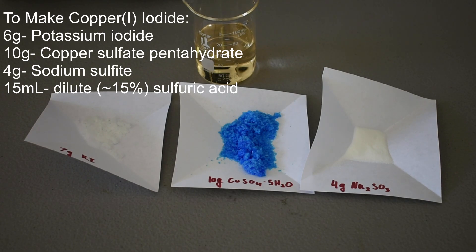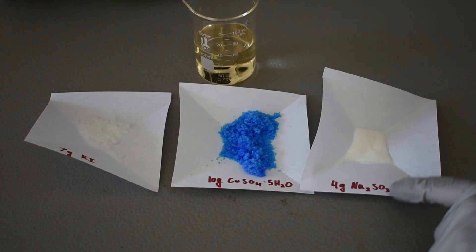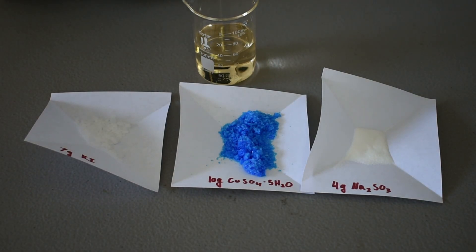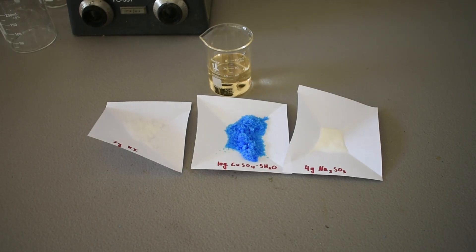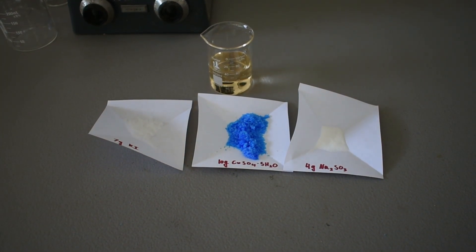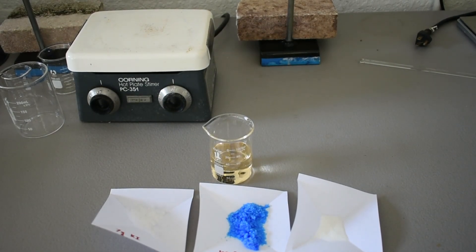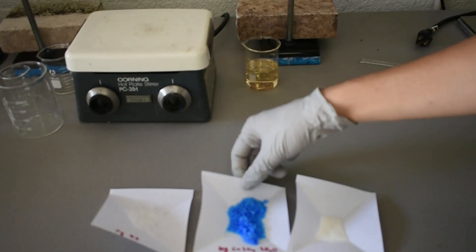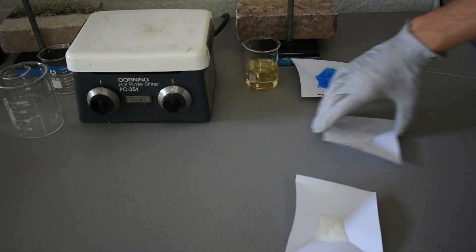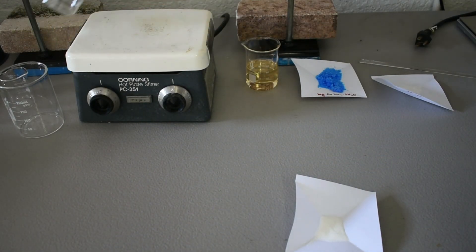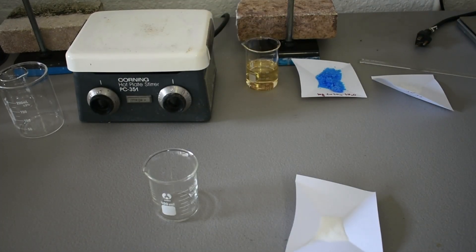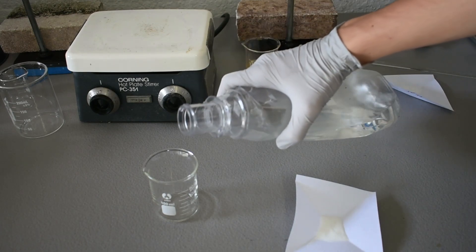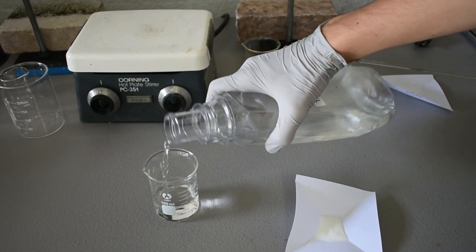So to start out, what we're going to do is dissolve 4 grams, which is what we have here, of the sodium sulfite in about 40 milliliters of water. I'm going to zoom on out again. I'm going to get a 100 milliliter beaker and add 40 milliliters of water. And in this preparation, exact quantities aren't very necessary, so just eyeball it.